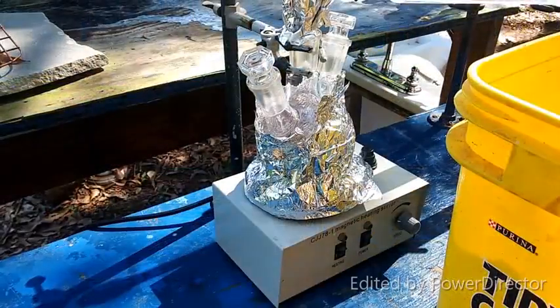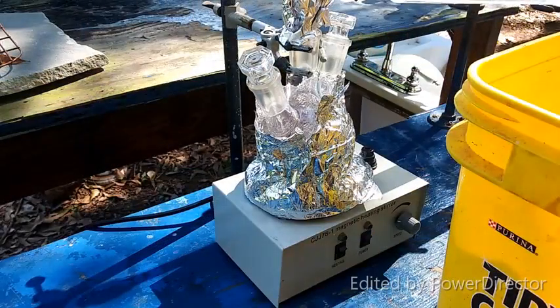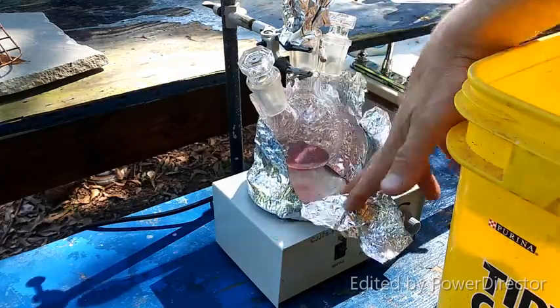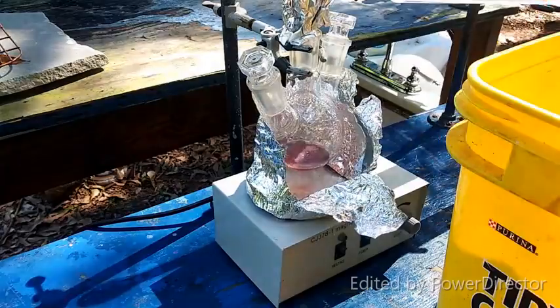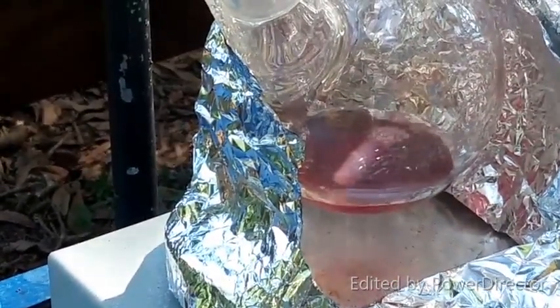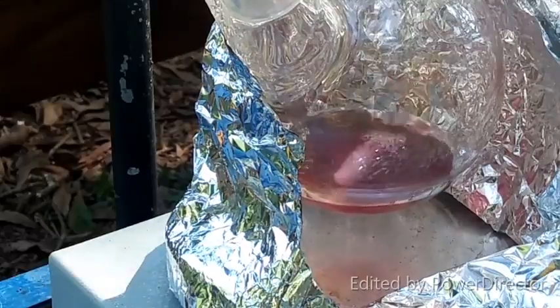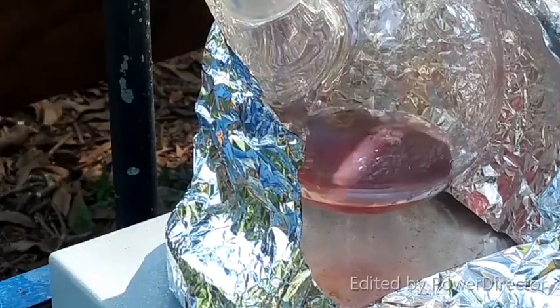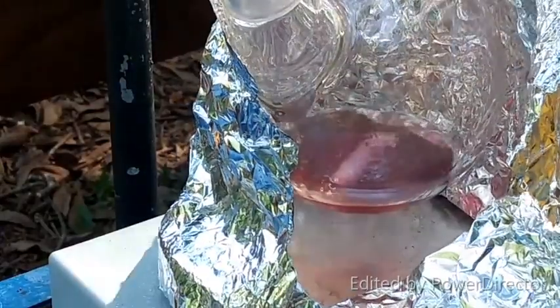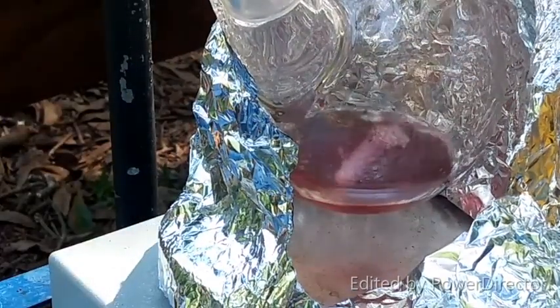Okay, people, it is done, or at least as done as it's going to get. I'll show you here real quick what it looks like. You can see it has turned a little bit purple because of the sunlight, but if there is a little bit of iodine in there, I don't really care. It's not going to hurt it for what I want to use it for. So I just want to get it out of the light though. But I want you guys to be able to see it too.